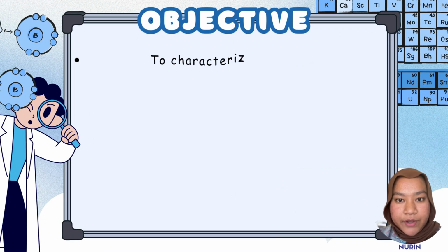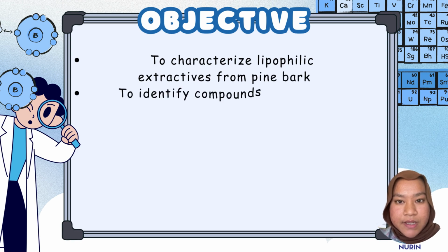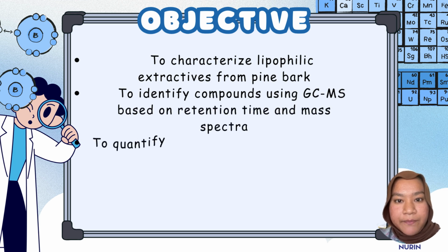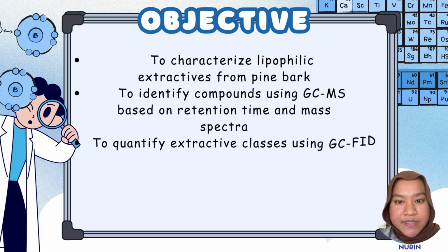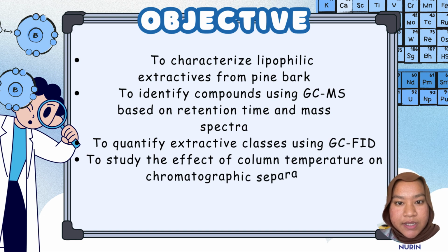The objectives of this experiment are to characterize lipophilic extractives obtained from pine bark, to identify the compounds using GC-MS based on retention time and mass spectral data, and to quantify the different classes of extractives using GC and FID. In addition, this study aims to investigate the effect of column temperature on chromatographic separation.